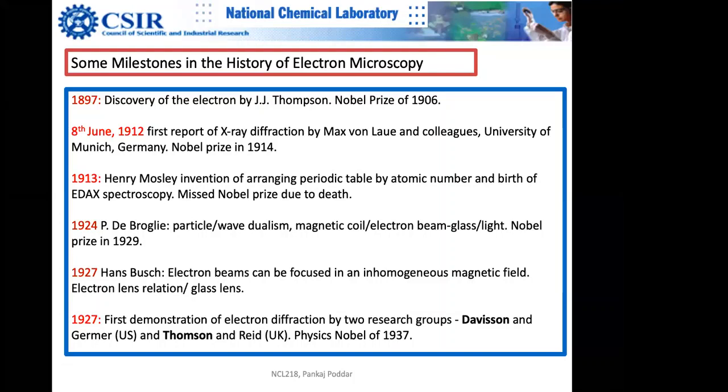Okay, so when I teach electron microscopy, students already learn in parallel almost everything about X-ray diffraction, because that is an integral part of it. Because X-rays are generated anyway, right? In the electron microscope, so many signals are generated. You will come to know.